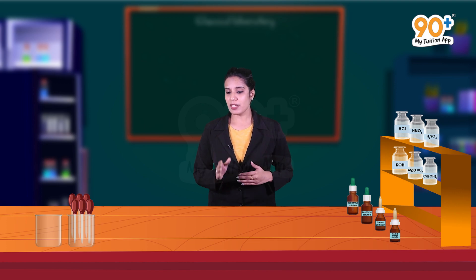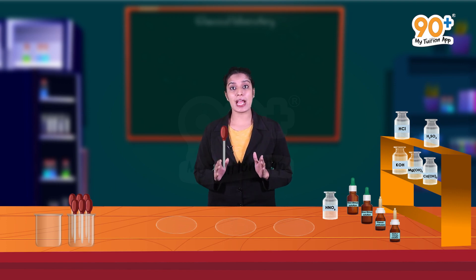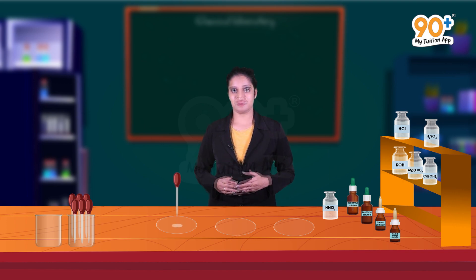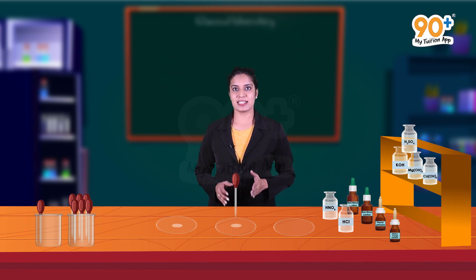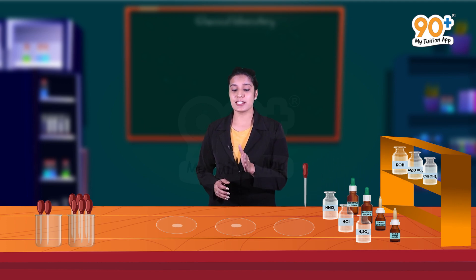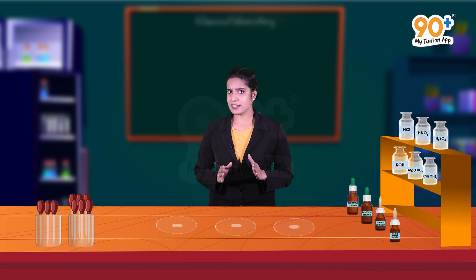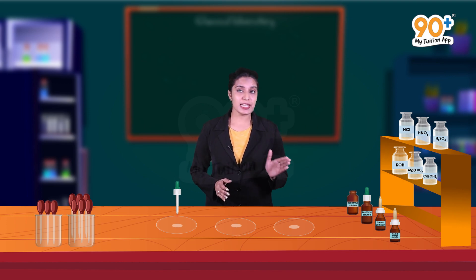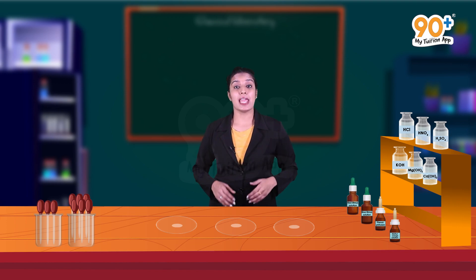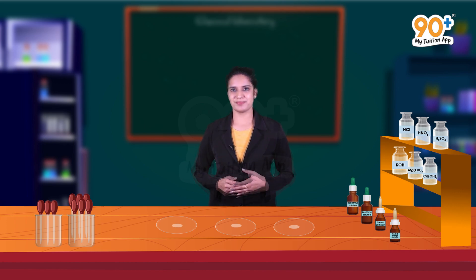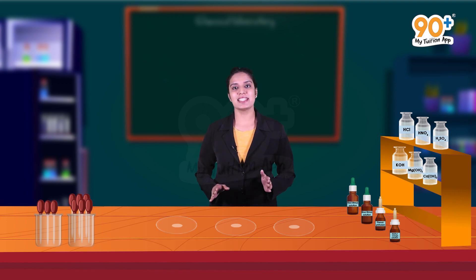Here I have three watch glasses. I am going to add one drop of nitric acid to the first watch glass, one drop of hydrochloric acid to the second watch glass, and one drop of sulfuric acid to the third watch glass. Now let's add one drop of red litmus solution to all of these watch glasses. Can you see any color change? No, we can't see any color change. It indicates that these solutions are not basic in nature.